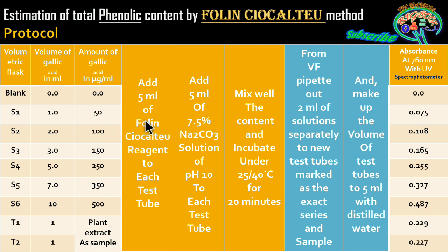As we are going to use high volumes of samples, standard series, reagent and buffer, we are going to take volumetric flasks of around 50 ml.